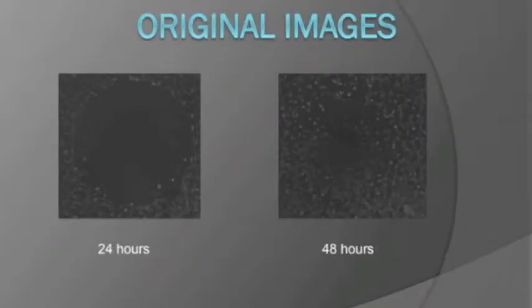Once the images at each time point of the cell migration have been taken, the images are analyzed using the ImageJ program. Using the data collected from the images, such as area and eccentricity of the wound, the rate of cell migration can be identified.